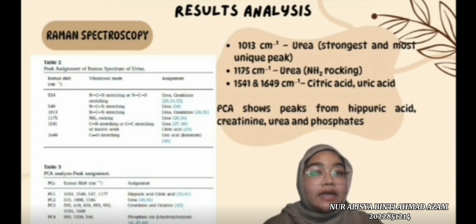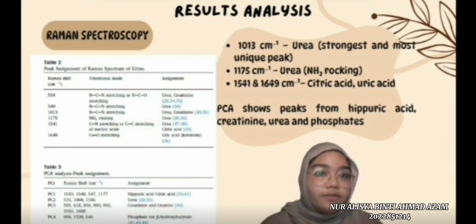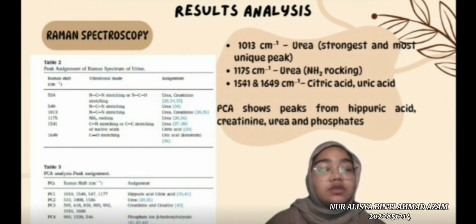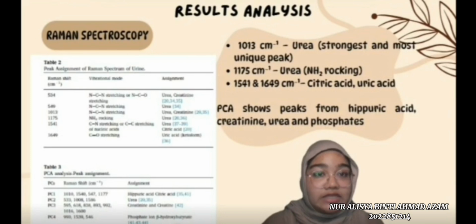So why is Raman spectroscopy used? Because it's non-destructive, fast and accurate, and it is able to detect the unique chemical features in each body fluid. As we can see in tables 2 and 3, we show the peaks and also the PCA based on what we have detected.